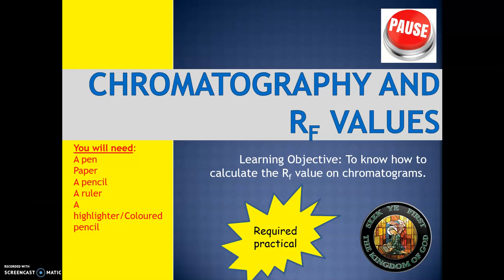Hello, and welcome to Key Stage 4 Chemistry topic, Chromatography and Rf Values, and this is a required practical.